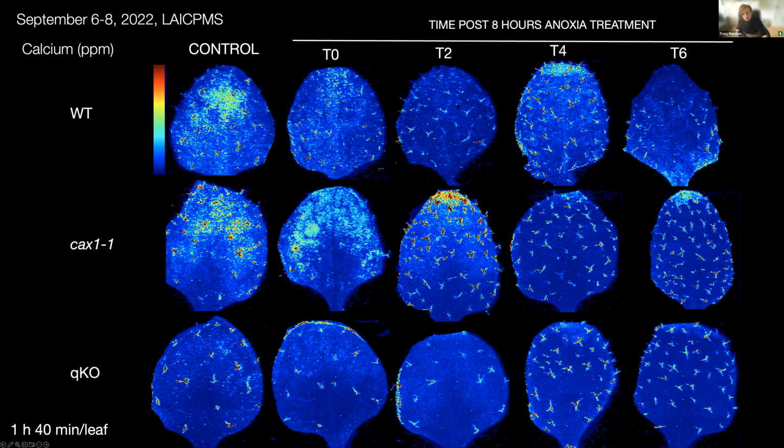And we did start to see, and if you remember the video of the pulsing of calcium moving, we do start to see some indication that we've just missed waves of calcium, like here, also at the base here. And then these 2 also show that calcium is waved through the leaf. Again, that's a complete arm waving. Unless we can image faster and more often, we're never going to catch this happening.